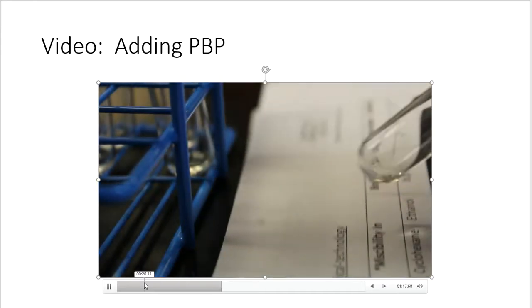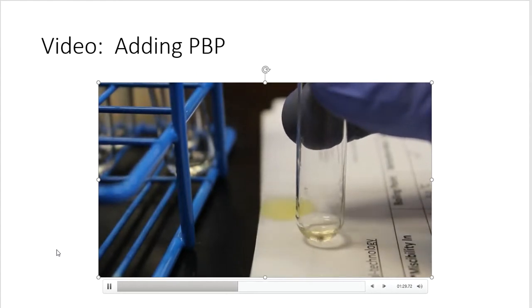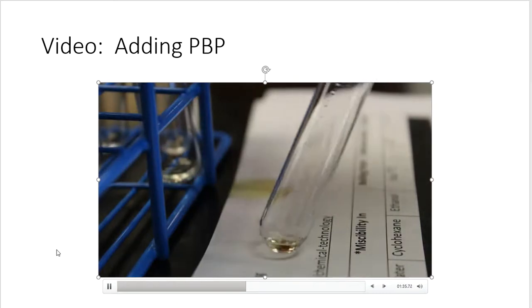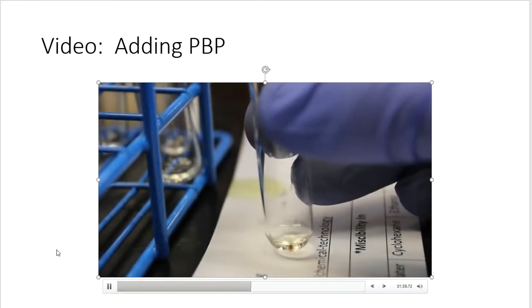All right, so I'll go to my next one and I'll keep doing it. So this one is cyclohexene with an ENE ending. There's the solution. You can probably see it in the test tube. 1, 2. I give it a shake. What do you see? And now 10 more.